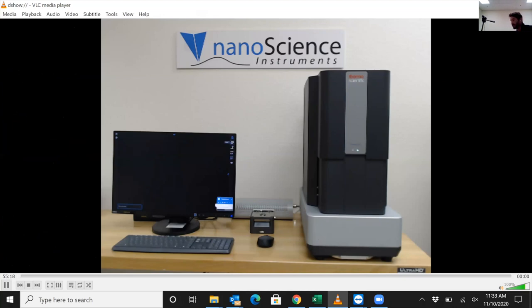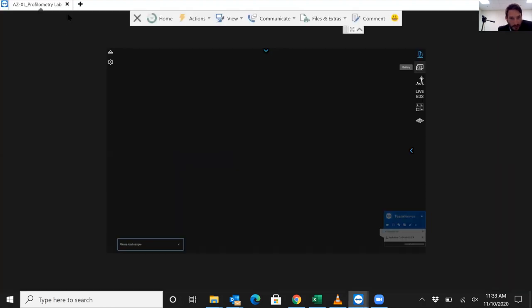This is a live video view of the Phenom, and I'm actually sitting at my laptop right now, so you don't see it. If I were controlling the Phenom, I would obviously be using this mouse right here, but I'm going to open the door of the Phenom from my laptop, and then I'm going to show you guys how we load the sample. So I'm going to go ahead and open that door, so the door should be opening.